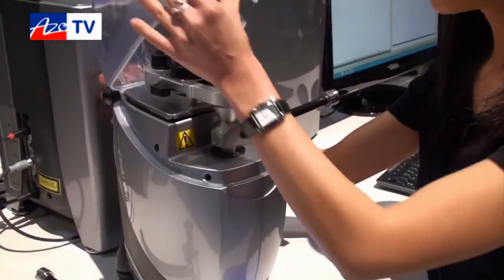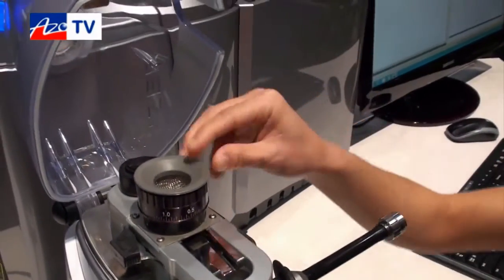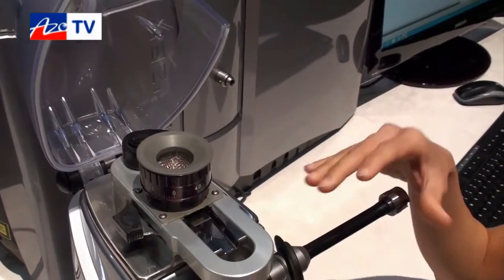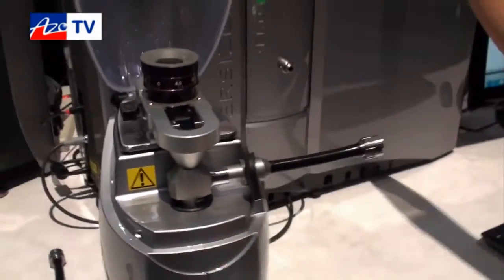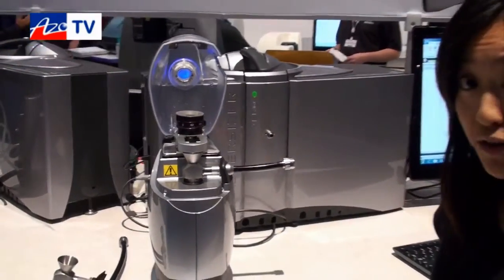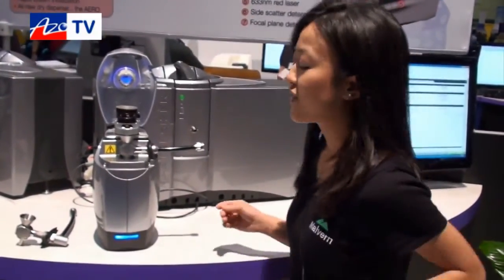As you can see, we have redesigned everything from the ground up. The way we introduce samples is different — you can put your samples into the hopper, adjust the height of the hopper to control how much powder flows through the vibrating chute, down into the venturi, through the measurement cell, and collected by the vacuum. Everything is driven by the software: air pressure from zero to four bar is fully controlled and automated by software.